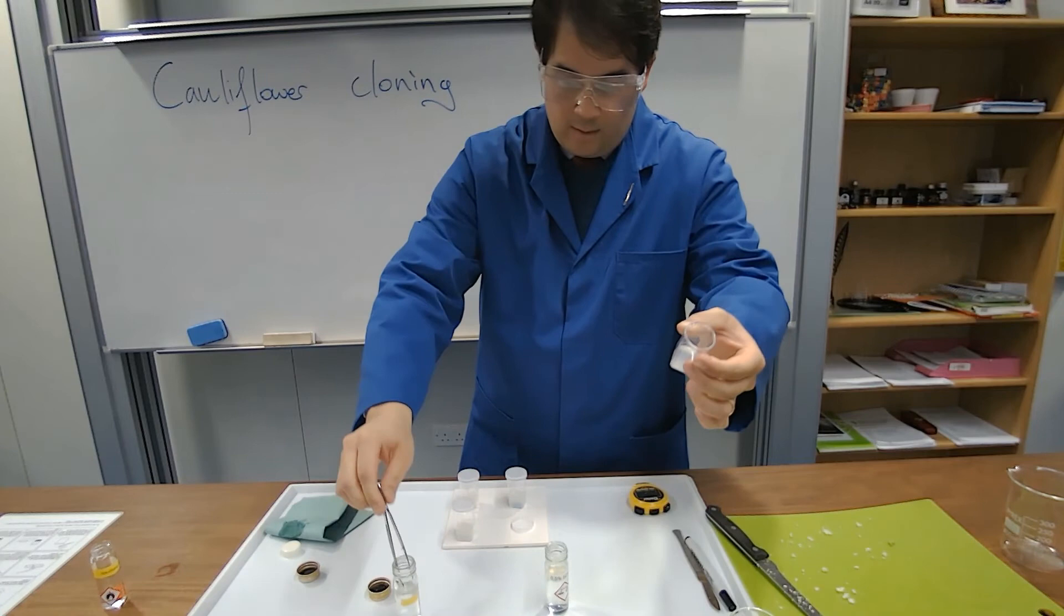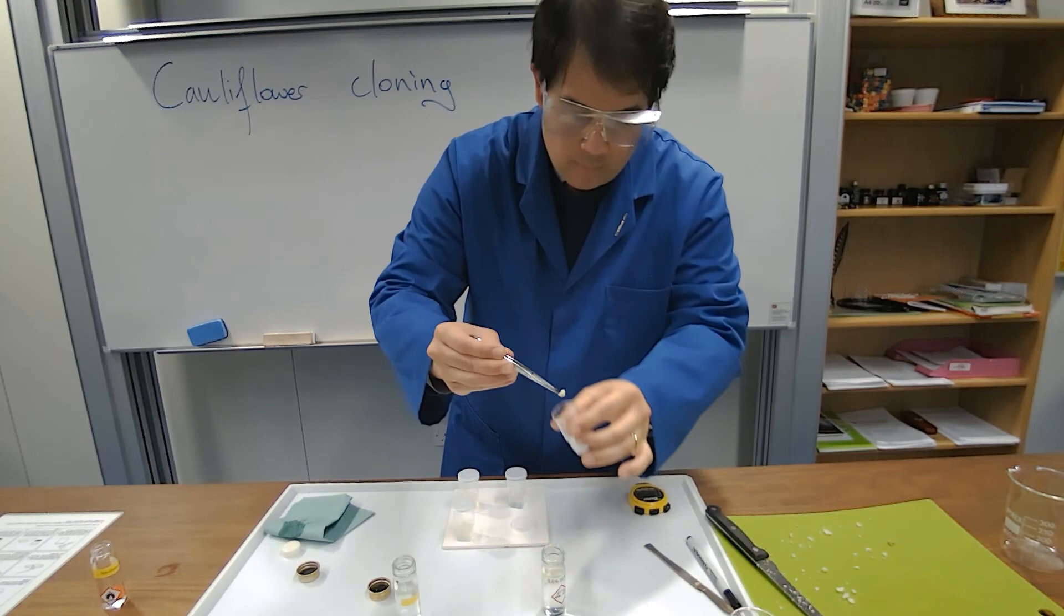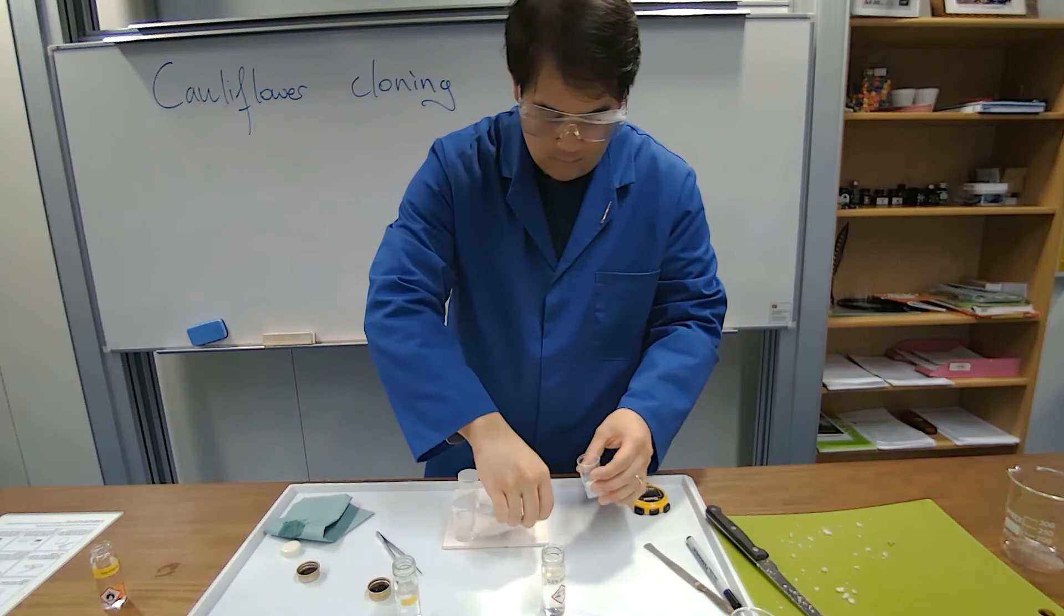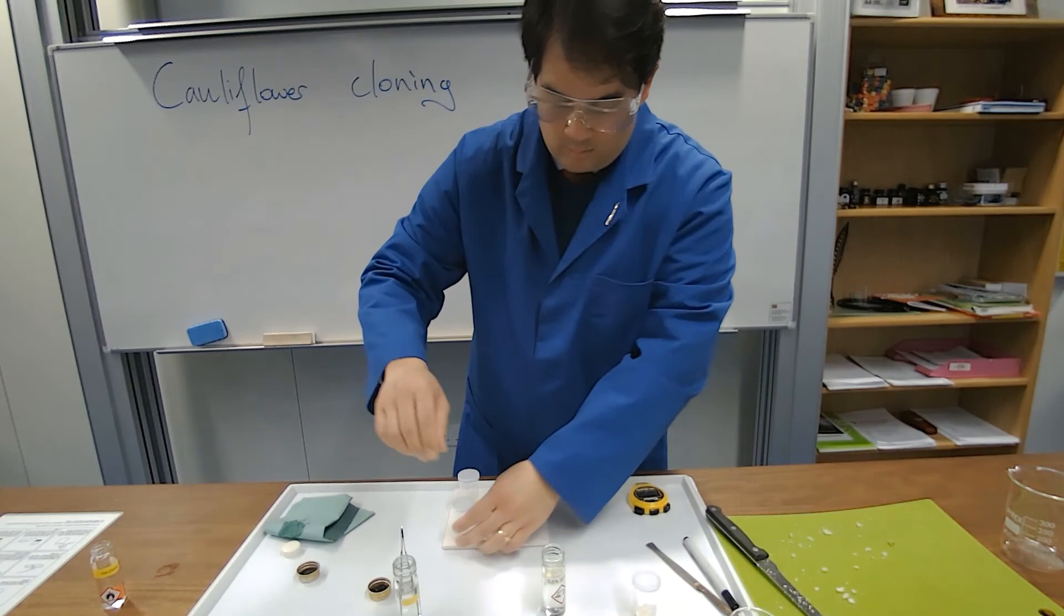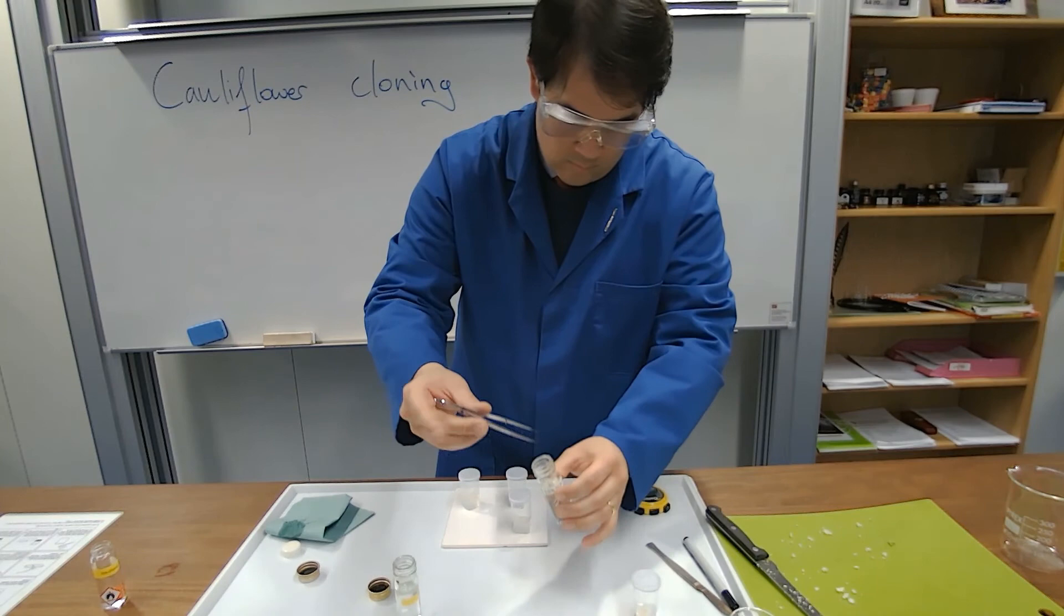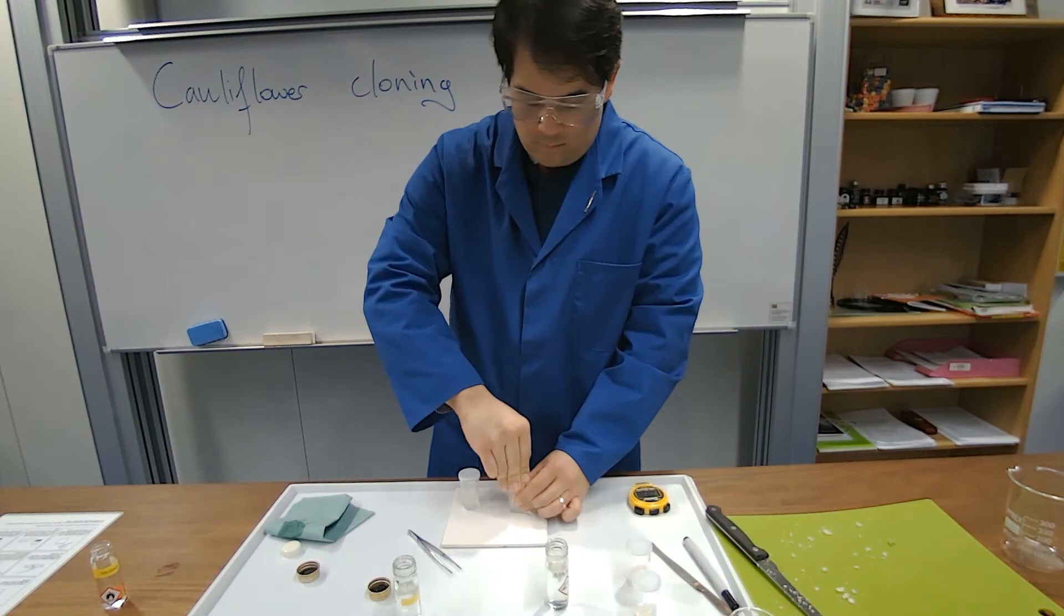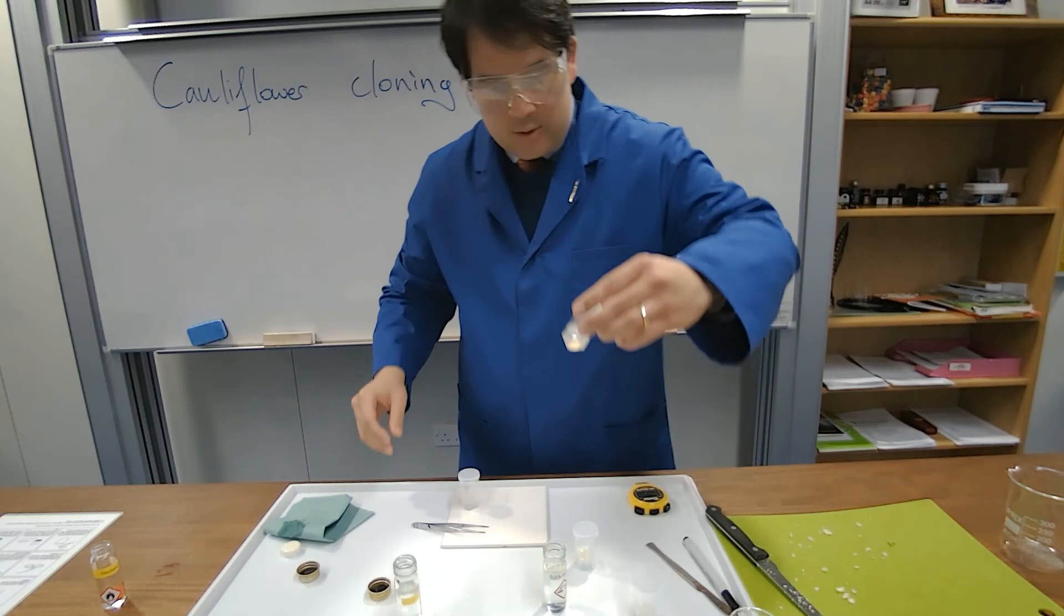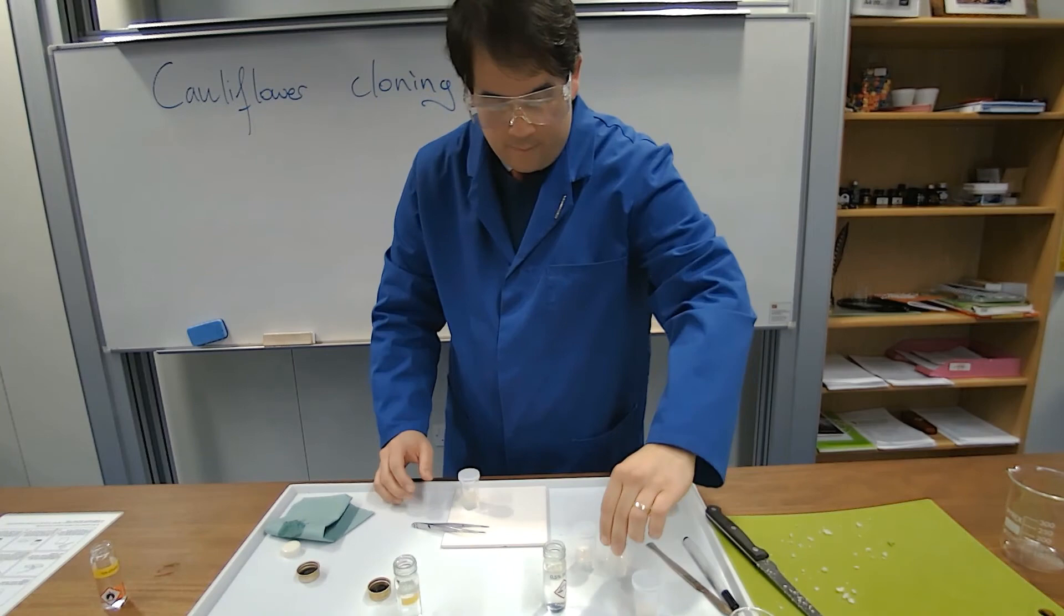And all it is, is we're going to put the explants firmly in the nutrient box. Okay. So you can see all it is, is just putting the little explant onto the medium itself. Give it the right growing conditions.